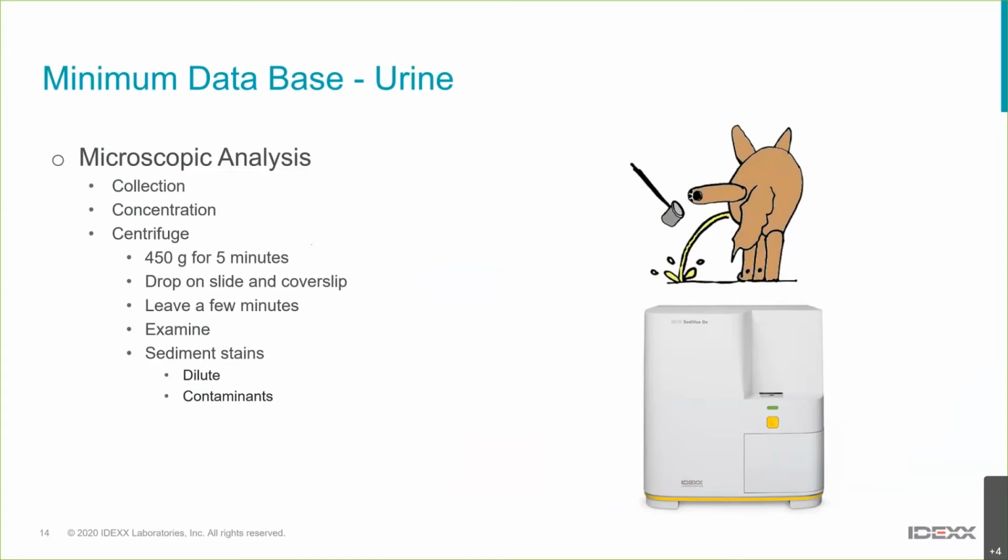The question often comes up: do we add a sediment stain or not? One of the challenges of using sediment stains is they can dilute out the sediment, so they spread things out a little bit. And the other thing with some of the sediment stains is there's the possibility that they have their own microflora, so you've got to interpret that with caution.